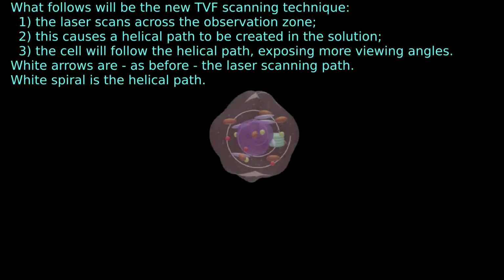However, simply rotating the suspected cancerous cell in the plane may not be enough for the scientist to confirm that it is indeed a cancerous cell. What that scientist may need is to view the cell from many more directions. So is there a better technique to do that?